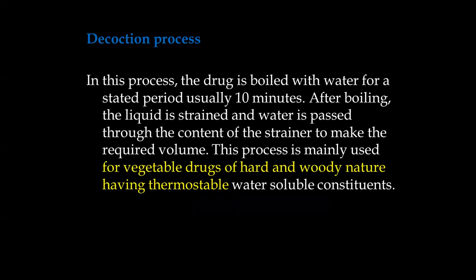The second process of maceration, Galenicals, is decoction. It is almost the same process as per the procedure. Here the drug material is hard and woody in nature, having thermostable water-soluble constituents. In this decoction process, the drug is boiled with water for a stated period, usually 10 minutes.